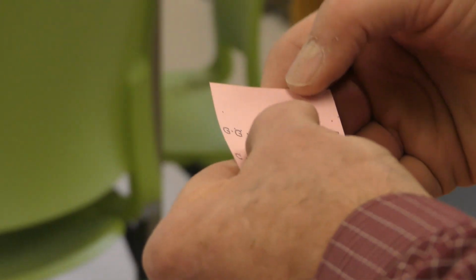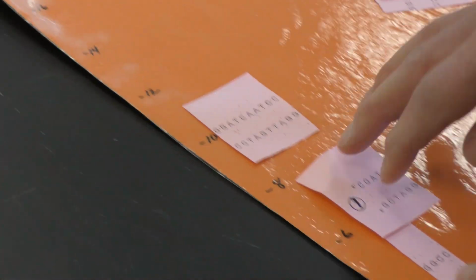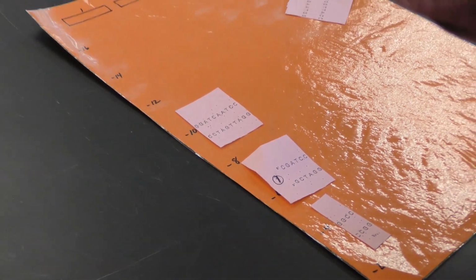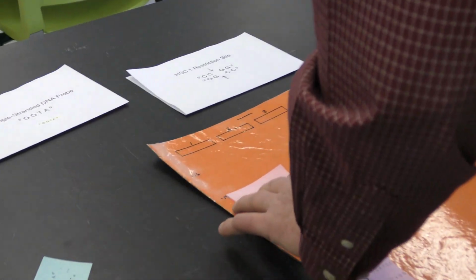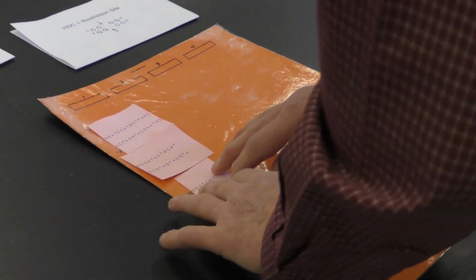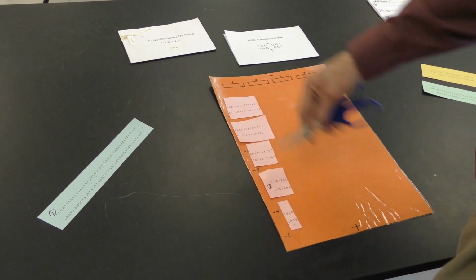I think I have 5. I think I have 1, 2, 3, 4, 5, 6, 7, 8, 9, 10 for that fragment. This fragment has 6. It would migrate down here. Remember the 6 fragments here, and this is going to probably be 1, 2, 3, 4, 5, 6, 11, and I think this is a 12. Okay. So basically, you want to trim off some of the excess paper to arrange them according to their size. Okay. So in this case, from that DNA piece, I generated 5 different fragments.